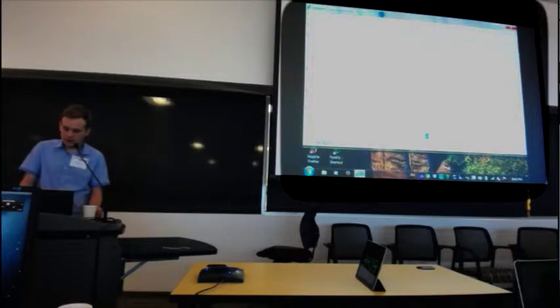This is where all the HDF5 files will be written, all the job outputs, and all the logs. This is the prefix for the XTC file names, E240 minus R0, which is okay because CASS will add the run numbers, 001, 002. The rest is not so important right now.